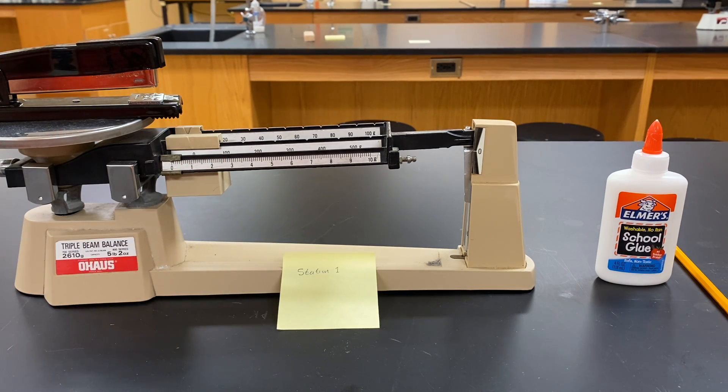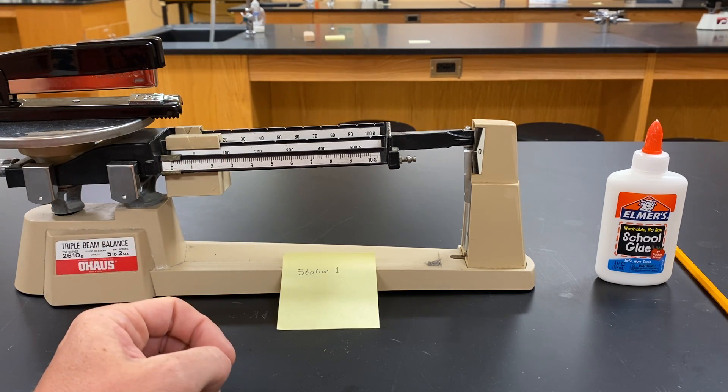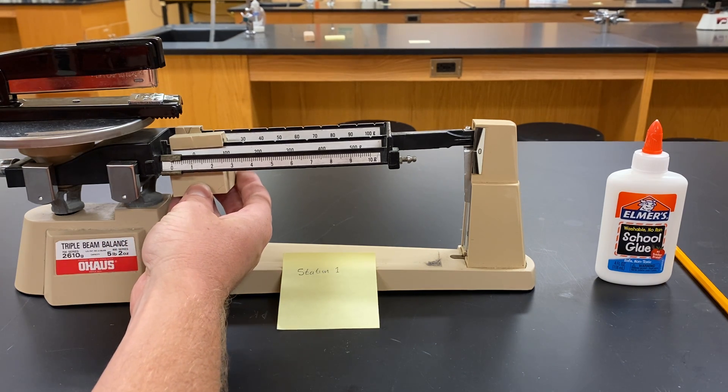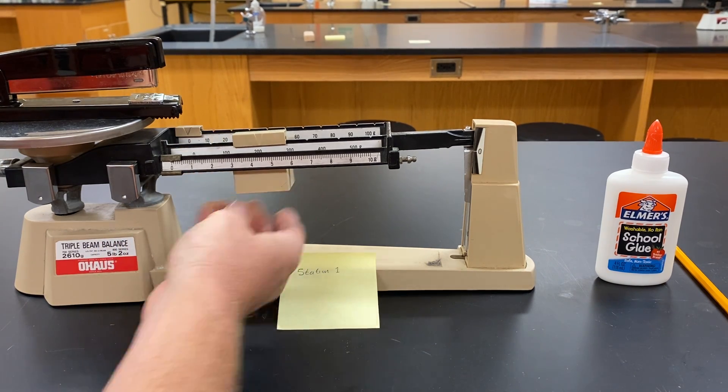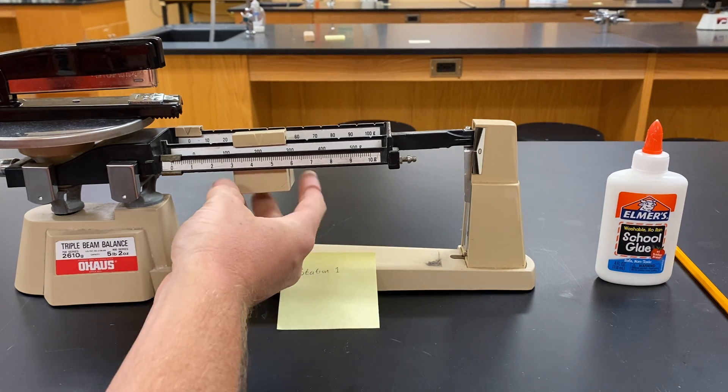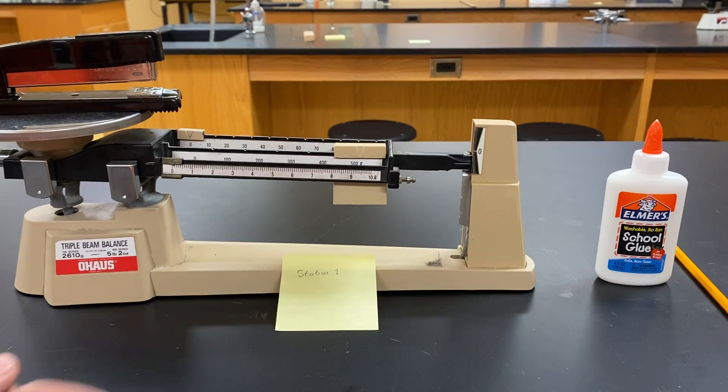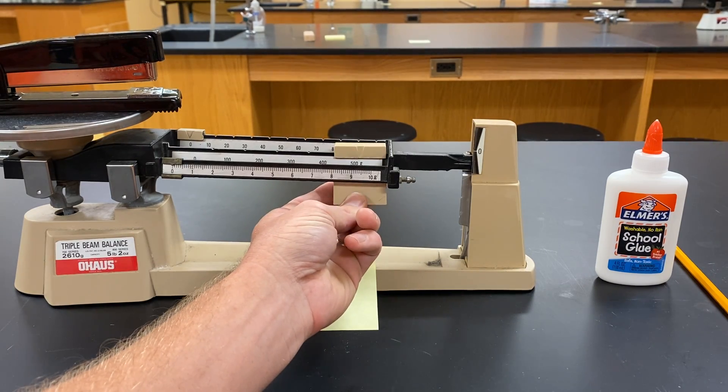We're going to have to balance it out with the weights. The first one we're going to start with is the largest one. We're just going to move it until this arm goes down. Right there at 500 grams we've got too much.